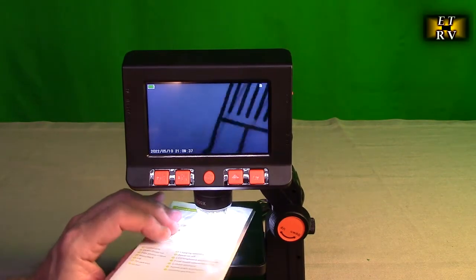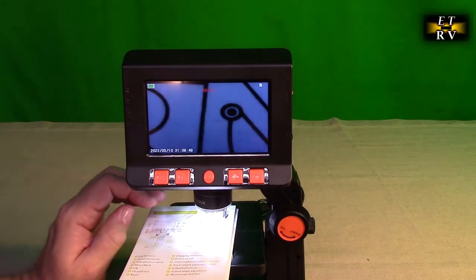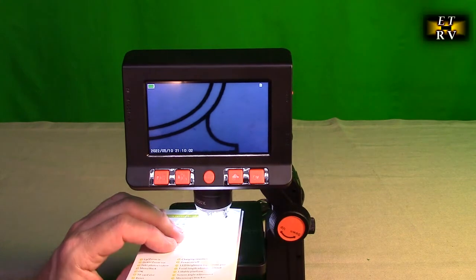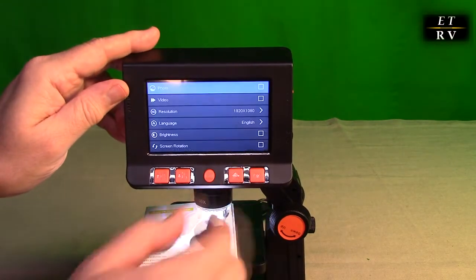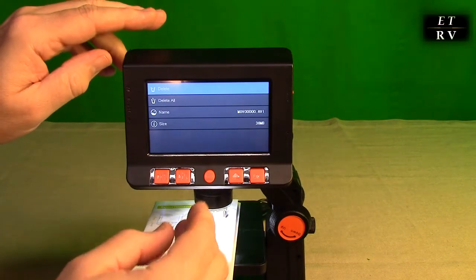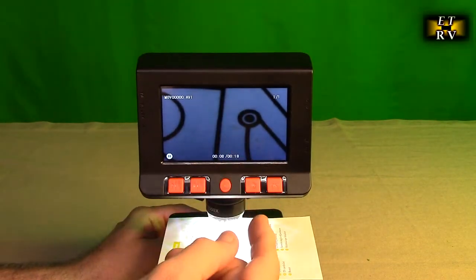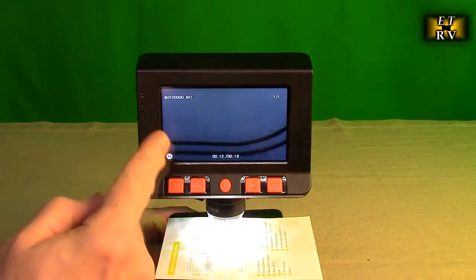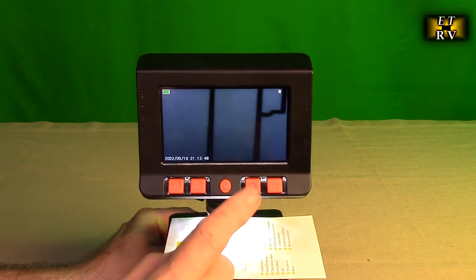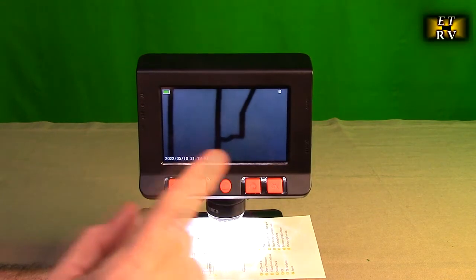Now if you want to take video, hold down this button right here and now it's taking video — there's a little timer right there. Let's verify that this is video by moving along and hitting the button again to stop the video. Go to the menu, scroll down to video, and now it's playing the video I just took. After you play that video you can delete it; it has the size of that video which is nice to know. Anytime you want to get back to the live screen, hold the home button for a couple of seconds and it goes back to the live view.